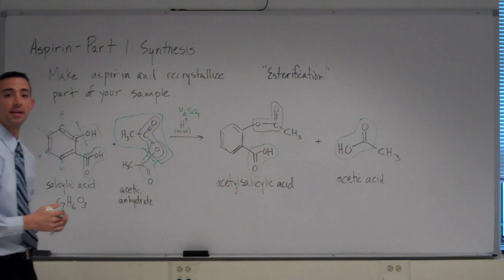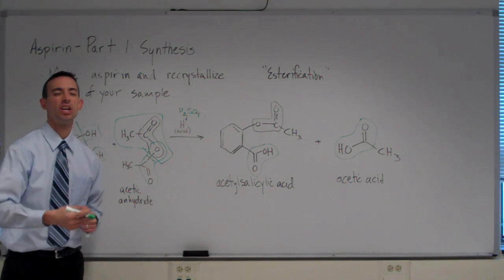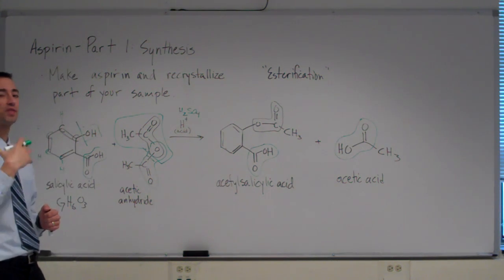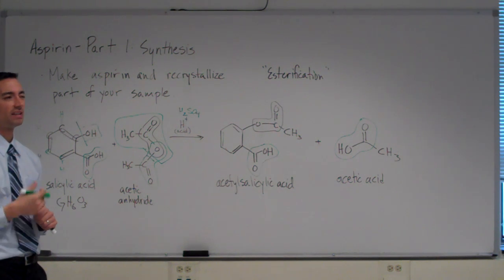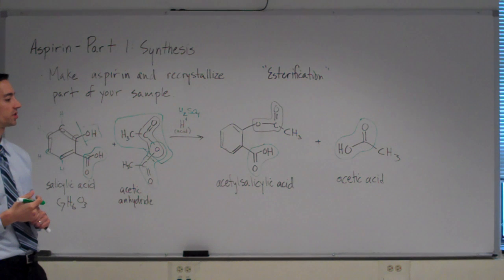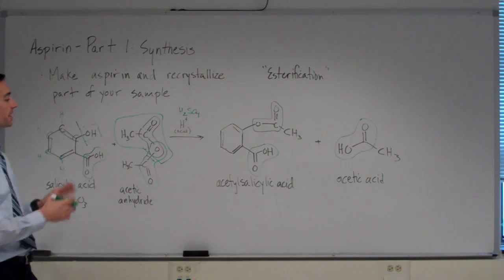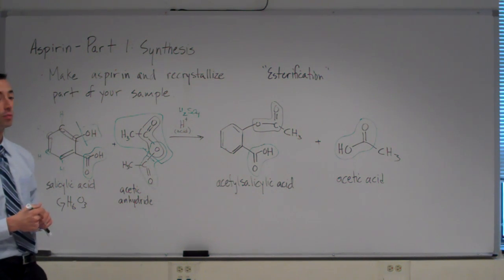Pretty concentrated, and that is an inhalation hazard. You don't want to be breathing in strong whiffs of the H2SO4 vapors. It can be very unsettling to breathe that into your lungs and cause you some distress. We'll be working in the hoods today, making sure you have this all set up in the chemical fume hood.